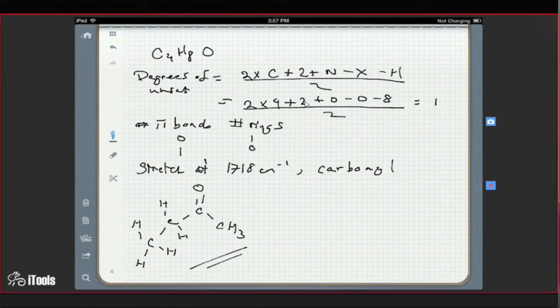Okay. You check the splitting on the CH2 group. That's pretty clear in the spectrum. Does that match your picture? Yeah, the splitting in the CH2 group. So the CH2 group has a quartet, which means that the adjacent carbon has 3 hydrogens on it. So we know that CH2 is attached to methyl.